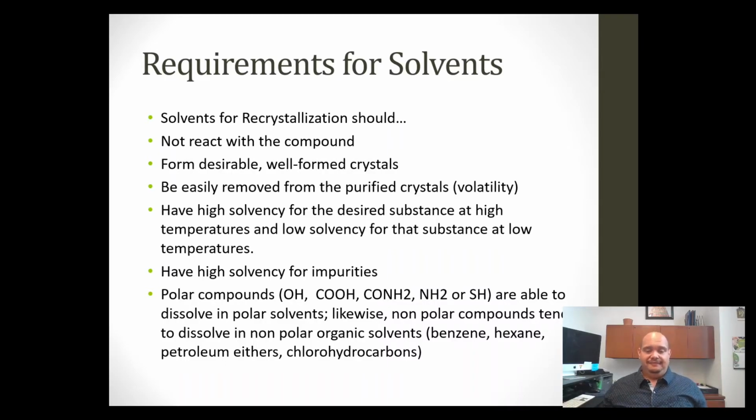If you take a solvent and you pour it onto this solute and it dissolves at room temperature, that's a terrible solvent for recrystallization for that solute, because it just dissolved your solute away, and you'll never get it back.